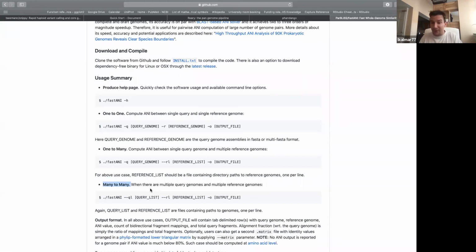Even if the sequence is there, even if the sequence is completely matching, you won't find any alignment. So just by taking exactly the same nucleotide sequence, exactly the same genome, fragmented, you are losing identity percentage here, which is of course not really what I want to see. So it's not a real difference. It's just a difference coming as a side product of your assembly process.